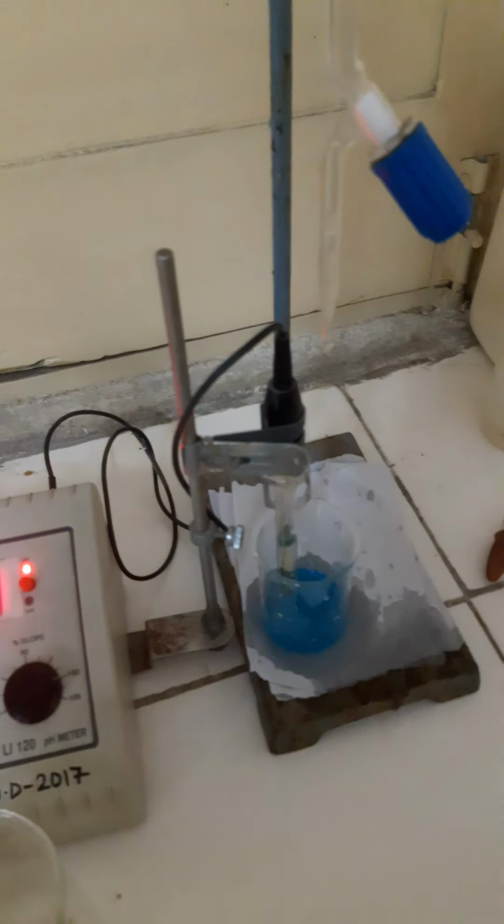After that you have to shake with the glass rod, then you have to note down the pH. As you note down, the pH will be increasing because we are adding the base. Similarly, you have to go up to 10 ml. You have to add the sodium hydroxide and note down the pH.